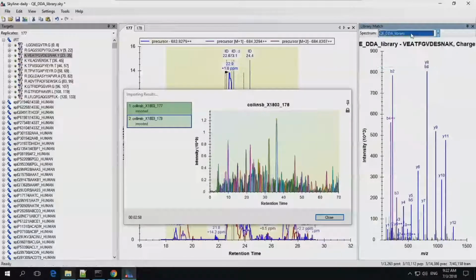All right, so I'm done with extraction. Who else is done with extraction? Okay, that's the great thing about having VMs. If we all click go at the same moment, it should take about 3 minutes to get through both of those. And then you can close that window.